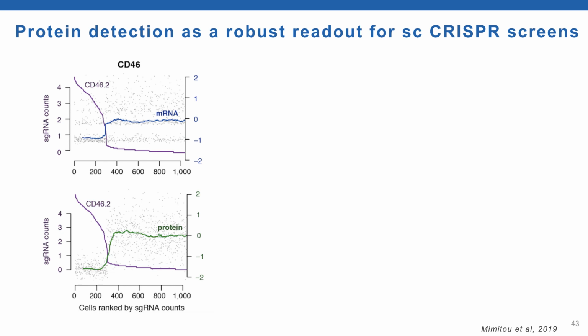When you contrast that to mRNA, where we know that this gene is expressed in all of these cells, there's a whole bunch of cells here where we never detect this mRNA in the first place. And that can also be reflected in the output of the screen, where you see the cloud of dots here just getting a little bit darker and maybe a little bit more sparse up here, but it's not the same reduction from all to nothing that we see at the protein level.